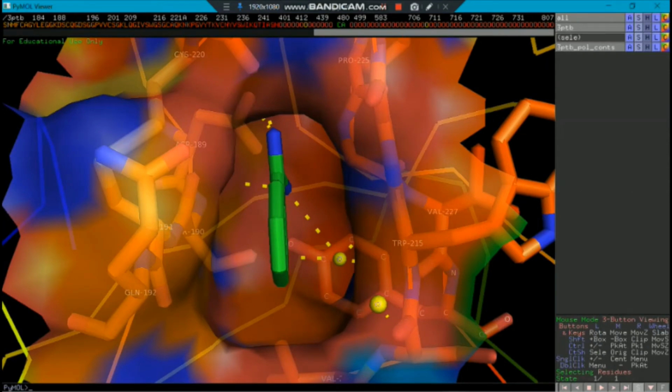This is because in the X-ray diffraction data, as I said, water molecules are necessary for protein crystallization, but the hydrogen atoms in water molecules are not diffracted. So hydrogen atoms are not detected, and therefore we have only oxygen atoms, and this is the reason why the O is written, right? We have a sequence of O, that means oxygen is written in the case of water. So wherever you find oxygen written, that means a water molecule is present there.